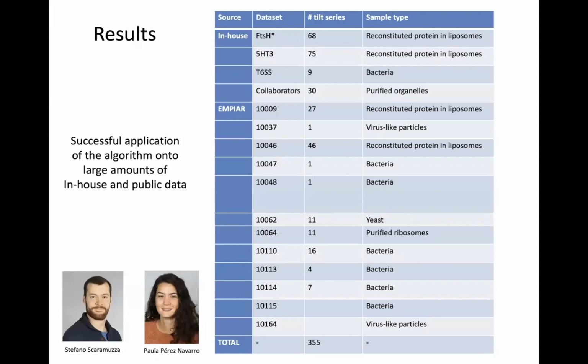We have been using this alignment with basically everything we could put our hands on from EMPIAR, and it's working quite robustly. We're deciding now what is the best metric to show these results in terms of RMS, percentage of gold beads that were actually located, etc.